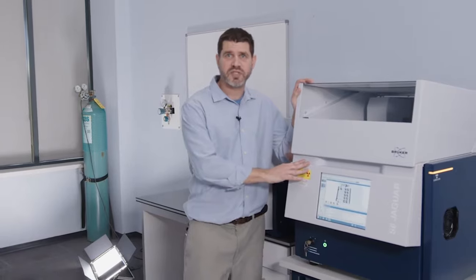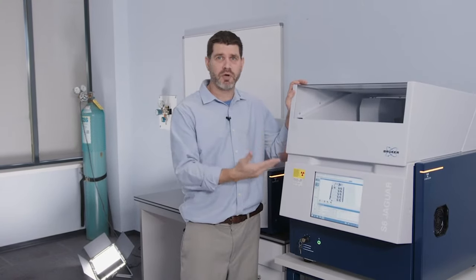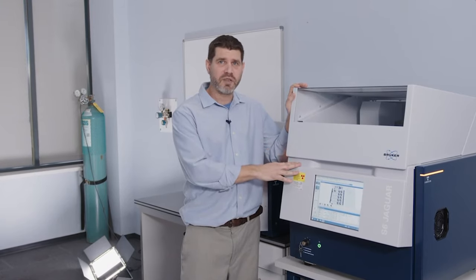Now, one of the disadvantages with energy dispersive systems is that it's lower in power. Also, it has a lot more line overlaps. So if you have an application that you need to step it up a little bit, you might want to go with something like a benchtop wavelength dispersive system. Now, if you want to learn more about benchtop wavelength dispersive systems, we have an episode about the S6 Jaguar on Live from the Lab.